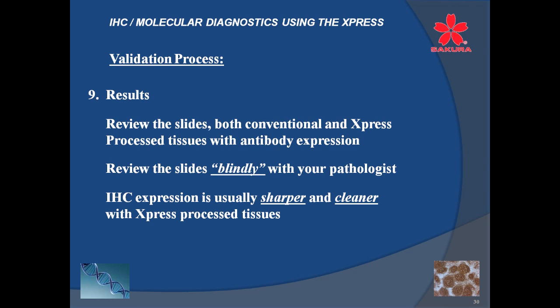What I have done is I give an H&E to them first and let them select which H&E is better. Which one can you see better nuclei and nuclear preservation, or the collagen is nicely defined, or whatever the case may be. Then pick the slide that you've done the antibodies on and the IHC expression and let them see the quality. Only at the end do you give them the real clue as to which slide is which, how it was processed, and then, of course, maybe how it was stained.